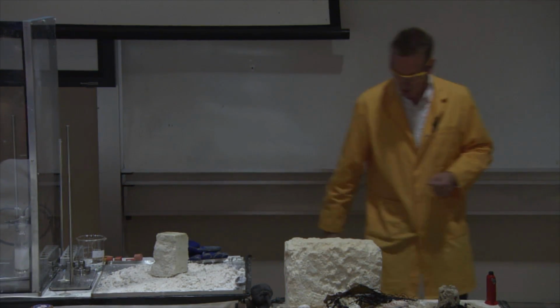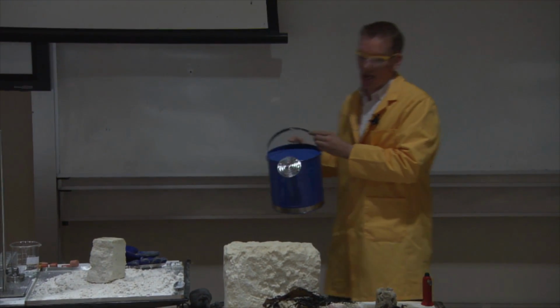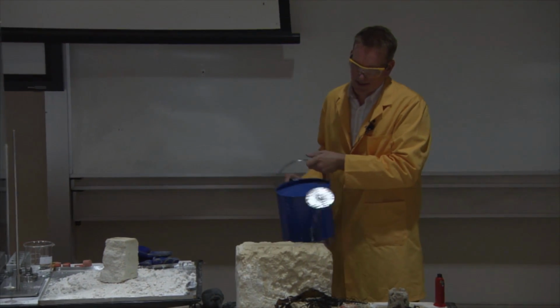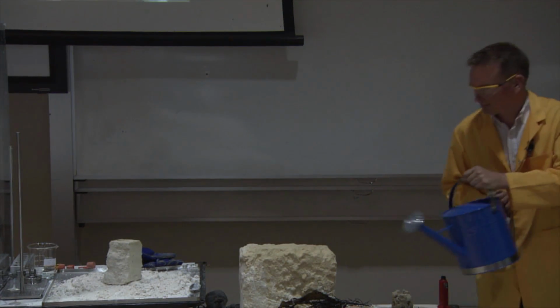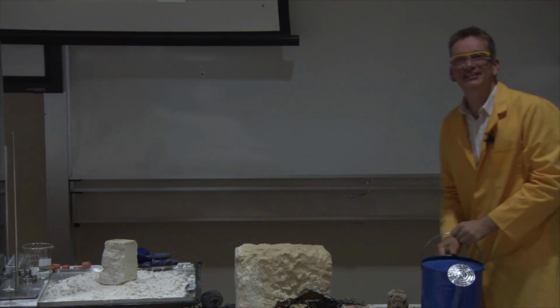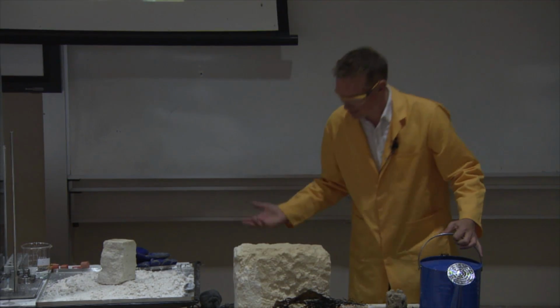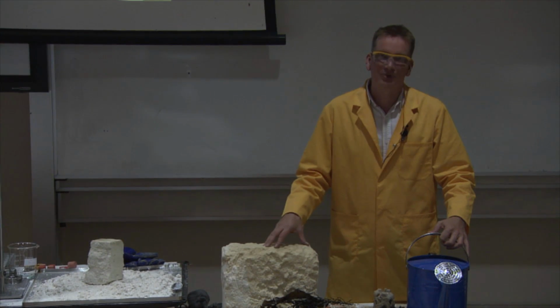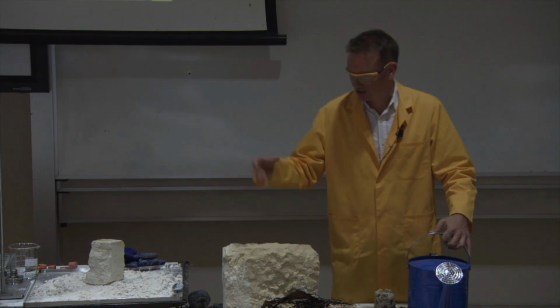But there's another difference as well. Watch what happens when I pour some water onto our limestone, onto our calcium carbonate. Now pay attention. Can you see what's happening here? Nothing. Nothing's happening at all. Well, this is very good, of course. What we've got now is a wet rock. But this is important because after all, we make buildings out of this, and it would be pretty bad if something did react every time it rained and our rock just disappeared.